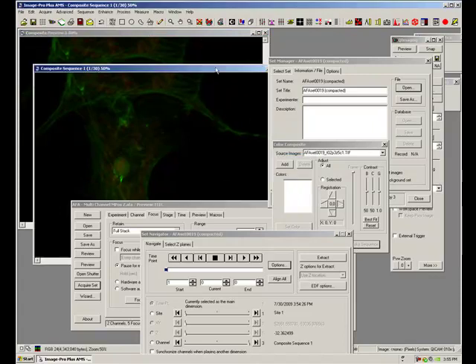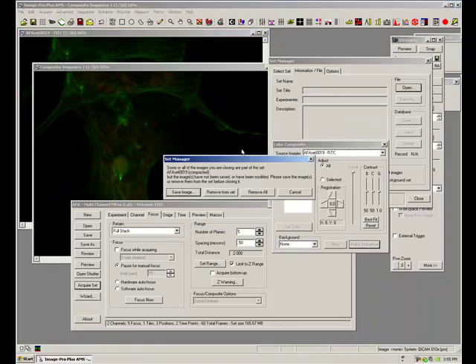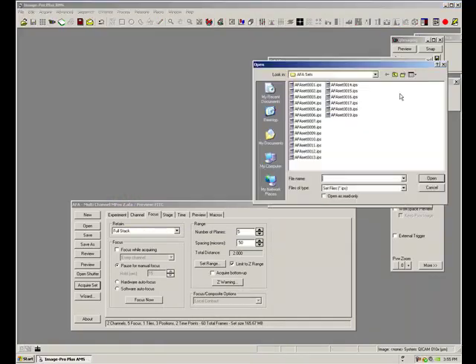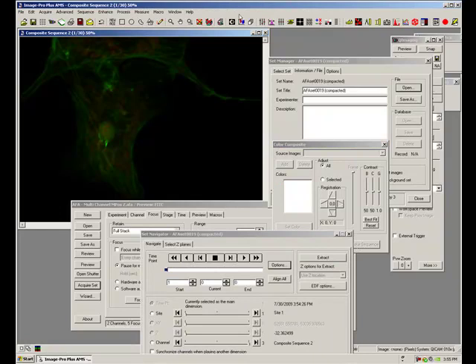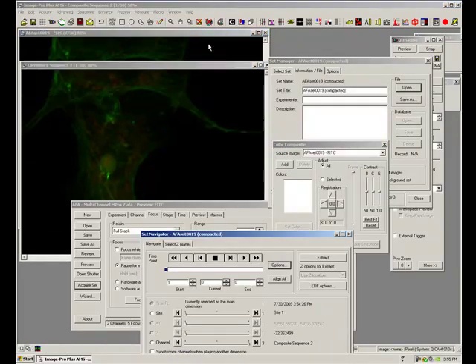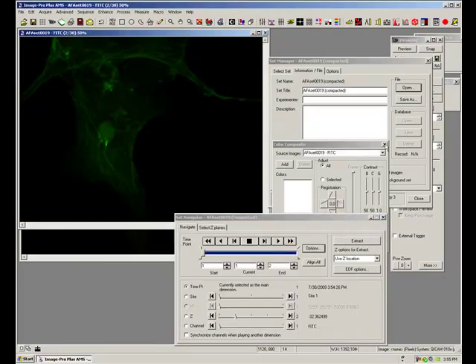I'm actually going to go straight to my set. And let's close everything down so I'm completely clear of everything and say open. Let's make the sequence. There's my composite sequence. There's my preview. Here's my dialogue. Let's get rid of every other dialogue. I'm getting a bit too dialogue happy.